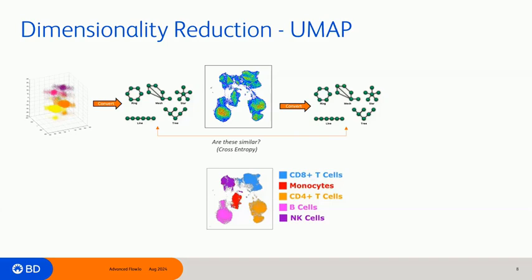So how does this kind of differ from t-SNE? One of the major differences with UMAP and t-SNE is, again, UMAP's ability to preserve more of the global structure of the data, while t-SNE focuses heavily on local relationships. UMAP strives to maintain both the local and broader global relationships, giving you a more accurate sense of how clusters are related to each other.